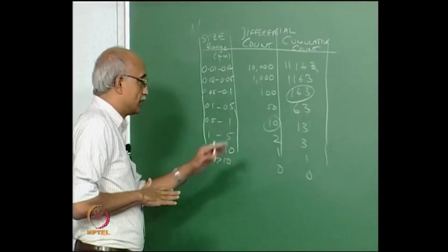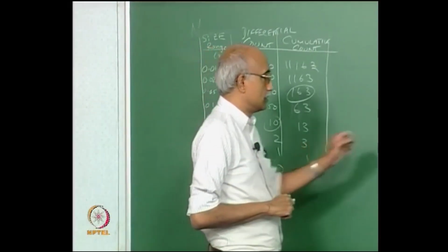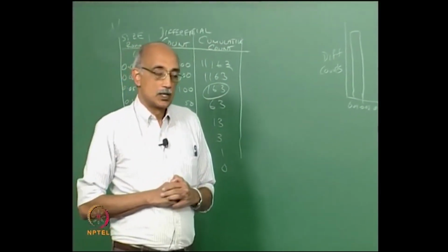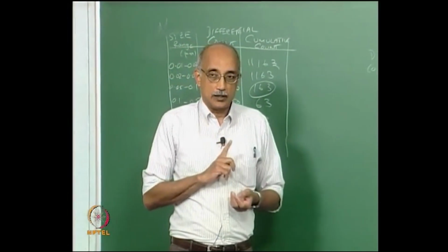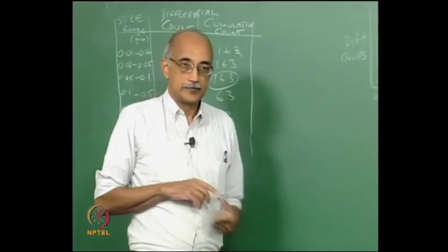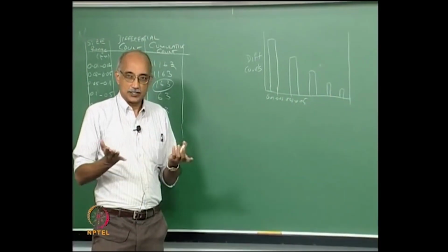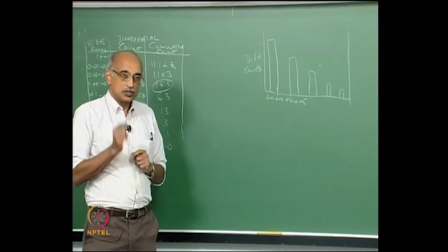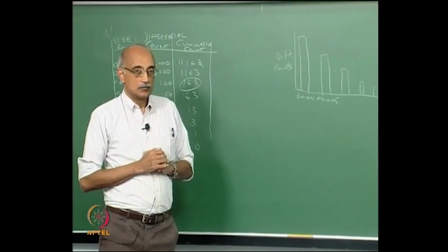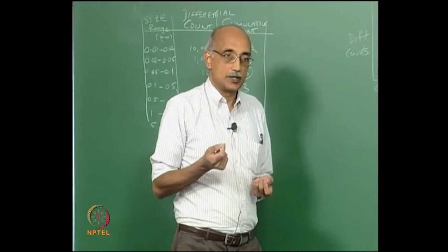Now, when you are graphing this data, you may also want to graph it as essentially a continuous curve, a continuous function. Now, it is always risky to do that with particle size distributions, because when you take discrete data and you convert it to a continuous function, what is the assumption? The key assumption is you know how to fill in the gaps, and that's a dangerous assumption when you're talking about particle populations. It kind of depends on how dilute the sample is.